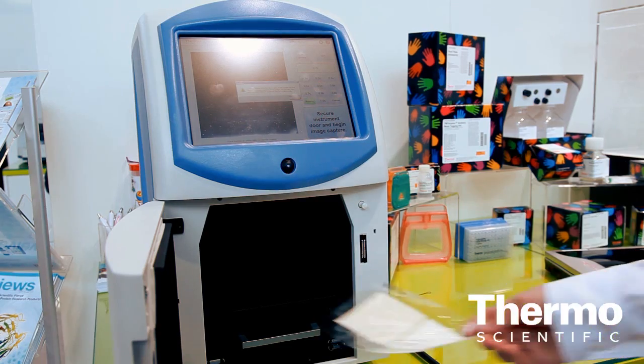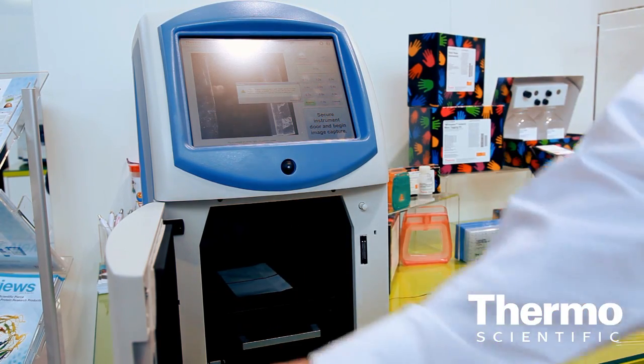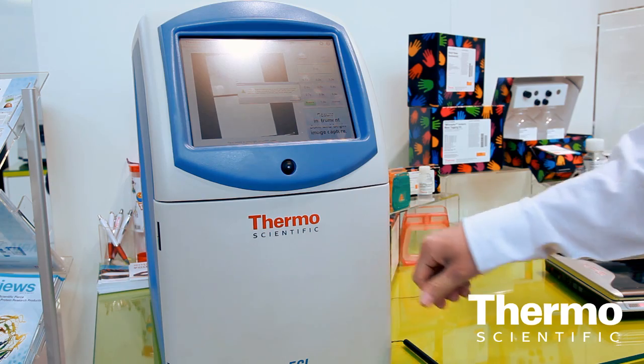And what about the range of applications in terms of gel documentation and Western blotting? Some of the really unique features with this: you've got one touch image capture. You can load a Western blot into this and literally with just one touch immediately begin to capture that particular image. That's definitely a very unique feature — you don't really have to spend any time with camera settings or adjusting things, which has traditionally been the case with CCD systems.